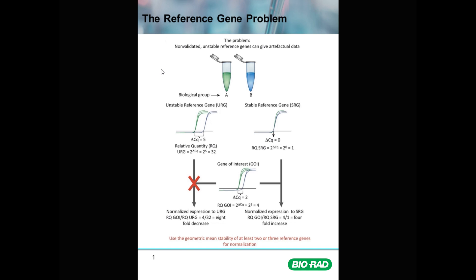In this example we have two biological groups — for example test group A and test group B, or control versus treated cDNA samples. If you're working with an unstable reference gene that changes in its own expression between the two groups, you get a relative quantity that is quite large. If the delta CQ is five between the control and treatment groups, the relative quantity is two to the power of five, which is a 32-fold difference in reference gene expression between control and treated.